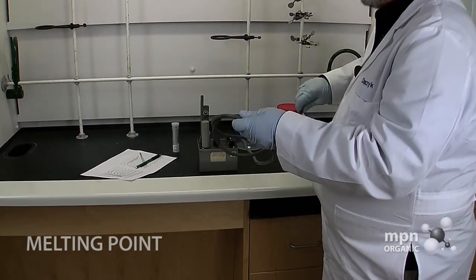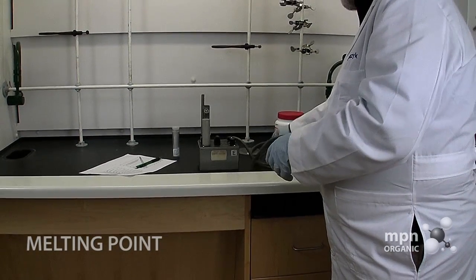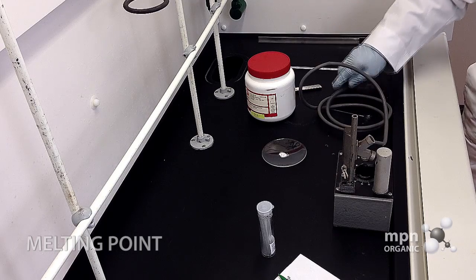Okay, so that's what you're going to be doing in the first experiment this semester, and I think that you're going to have a good time determining the melting point of materials that we give to you.